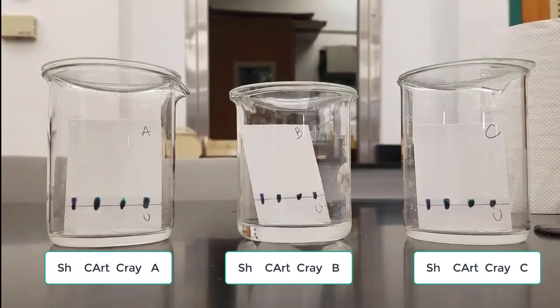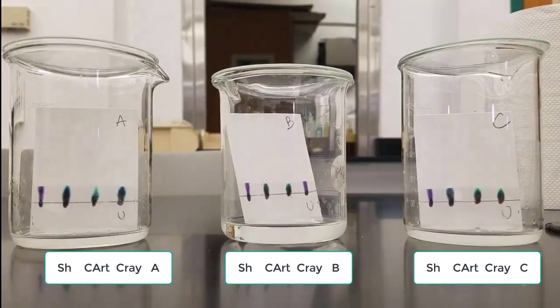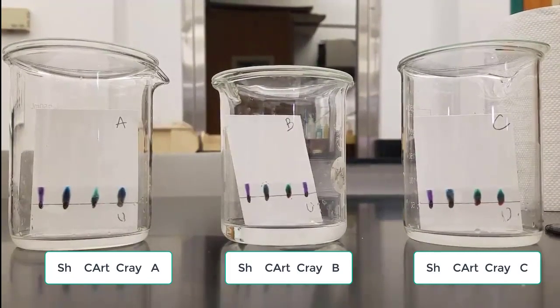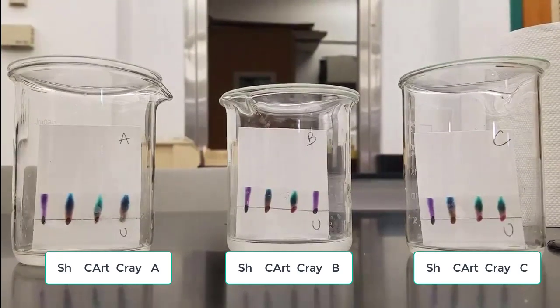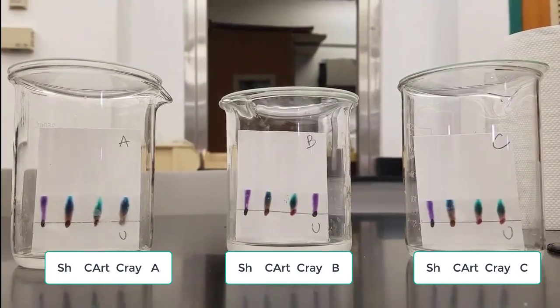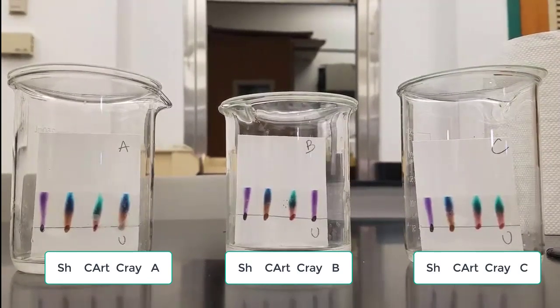You can see those inks starting to move in the methanol, which we expected because we saw that last time. You want to look for on each of them which ink does the unknown match, because that's our goal: to say the unknown is definitely the Sharpie or the unknown is definitely the Crazy Art pen. So you're looking for what does the unknown match on each of them.